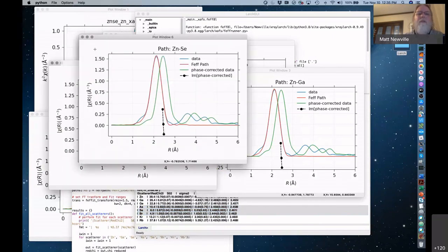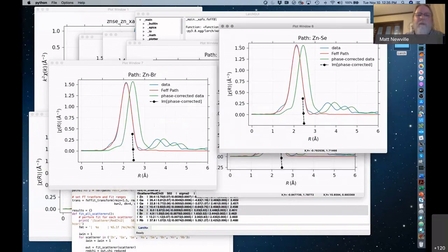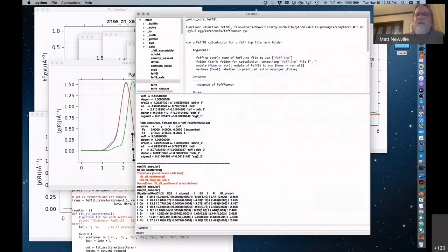Bromine, there's selenium. Are any of these better or worse? I would say that you could probably conclude that zinc is definitely worse, and maybe zinc gallium is worse. But the other ones, it's hard to tell. So it's selenium plus or minus a Z of 1.